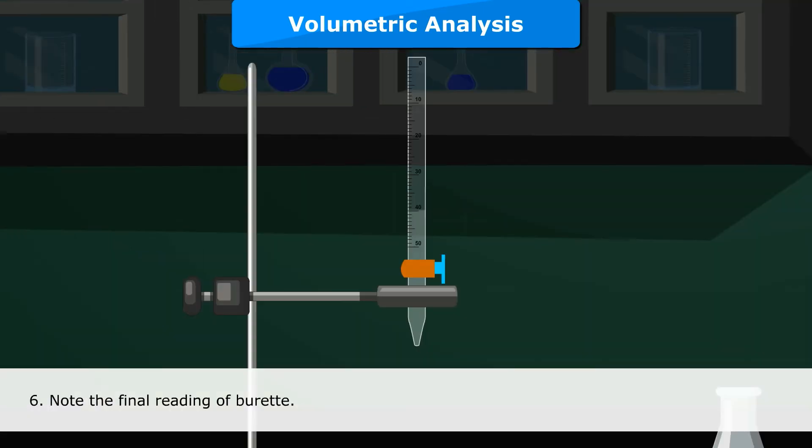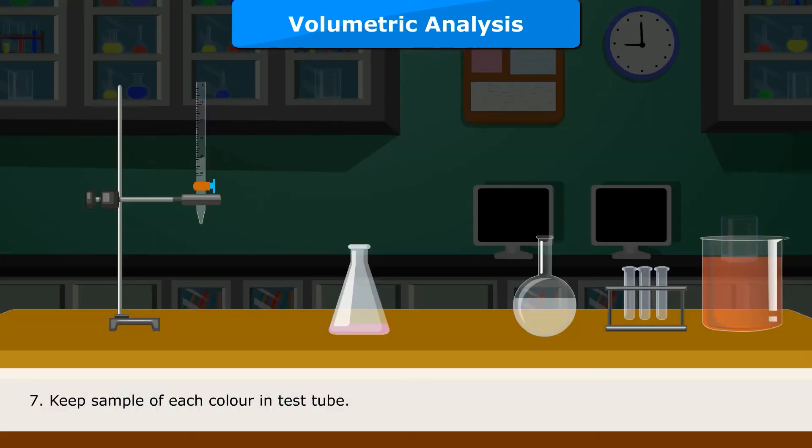Note the final reading of burette. Keep sample of each color in test tube. Take another reading to obtain at least 2 concordant readings.